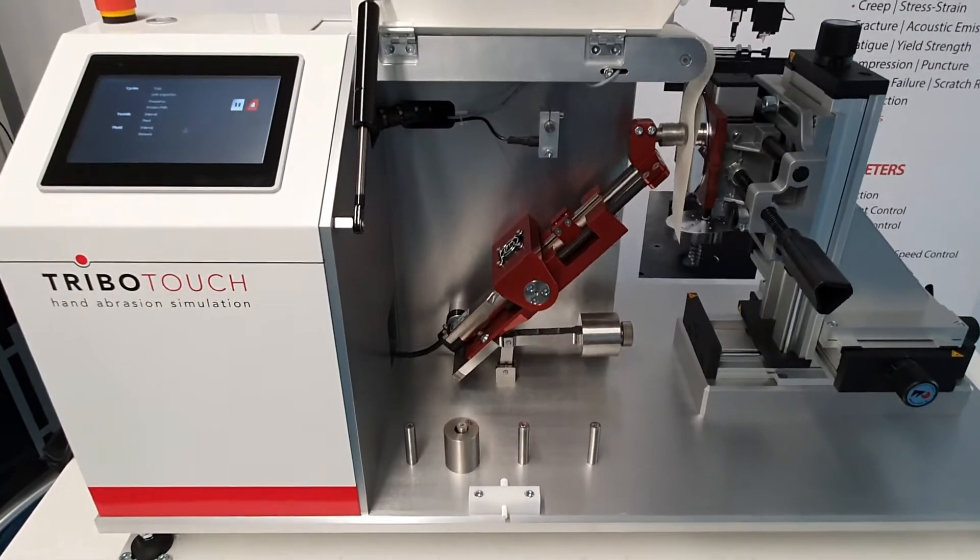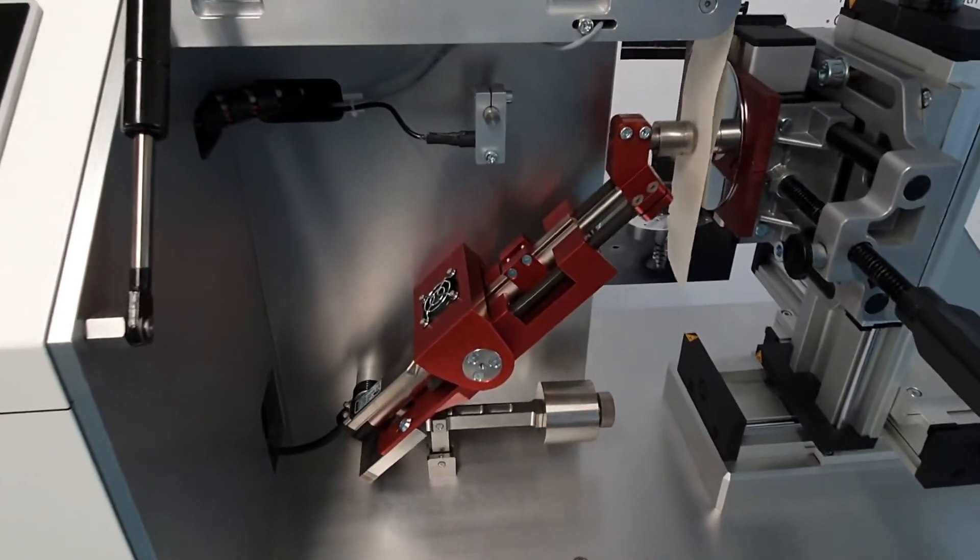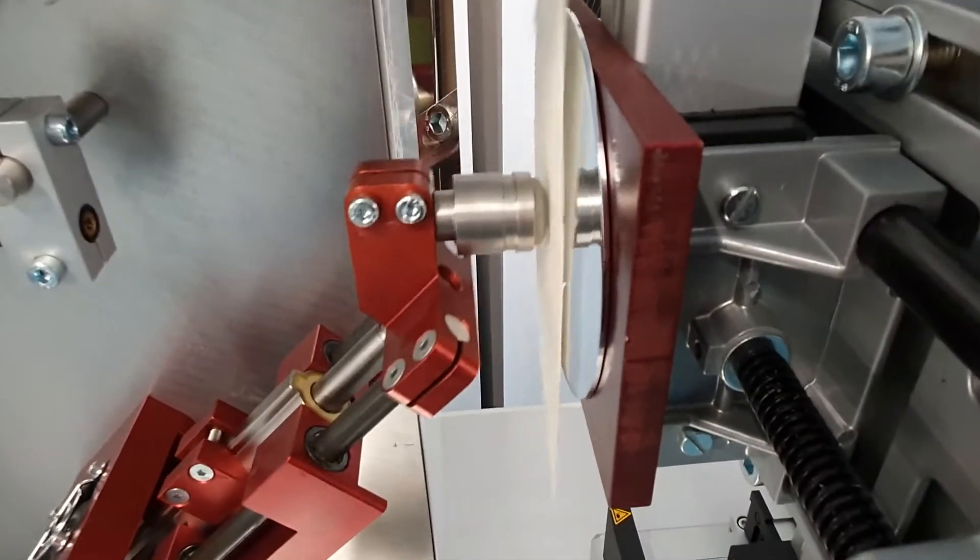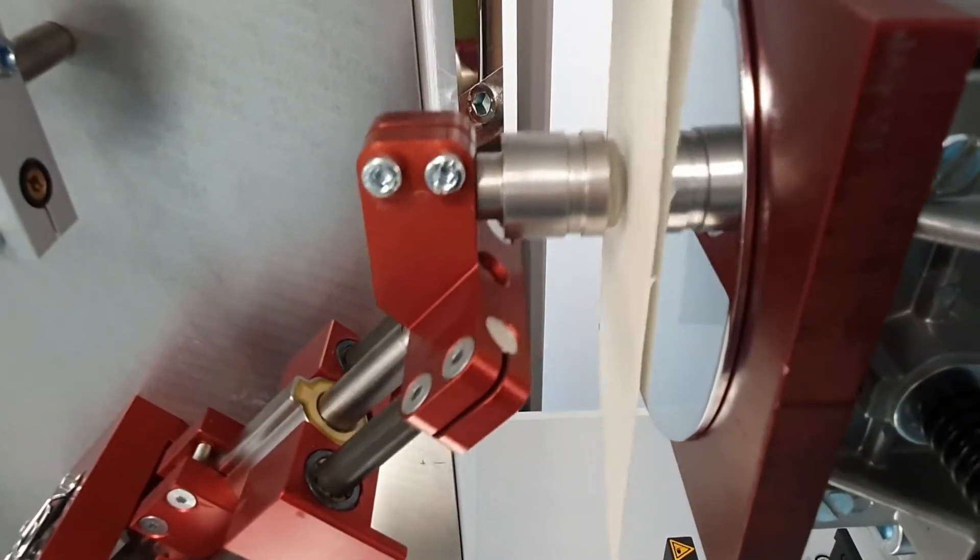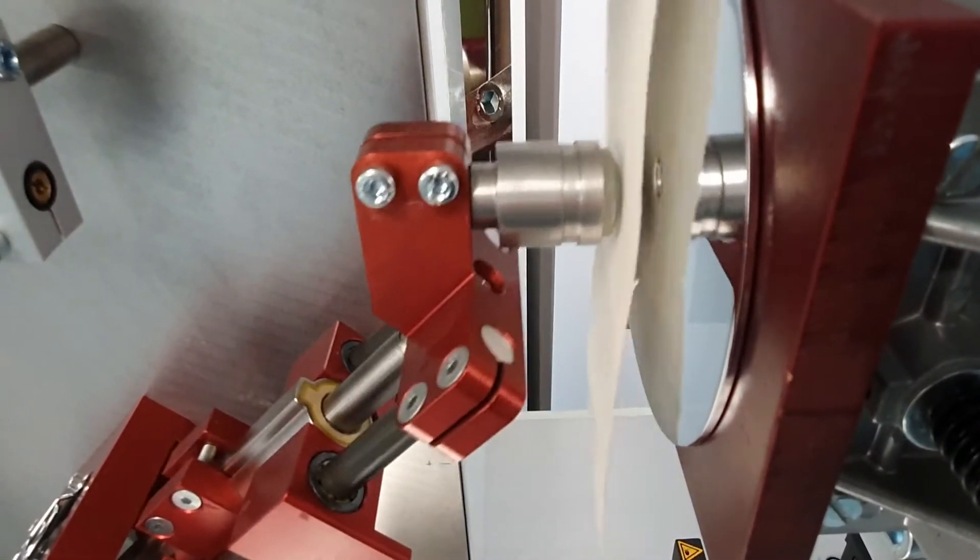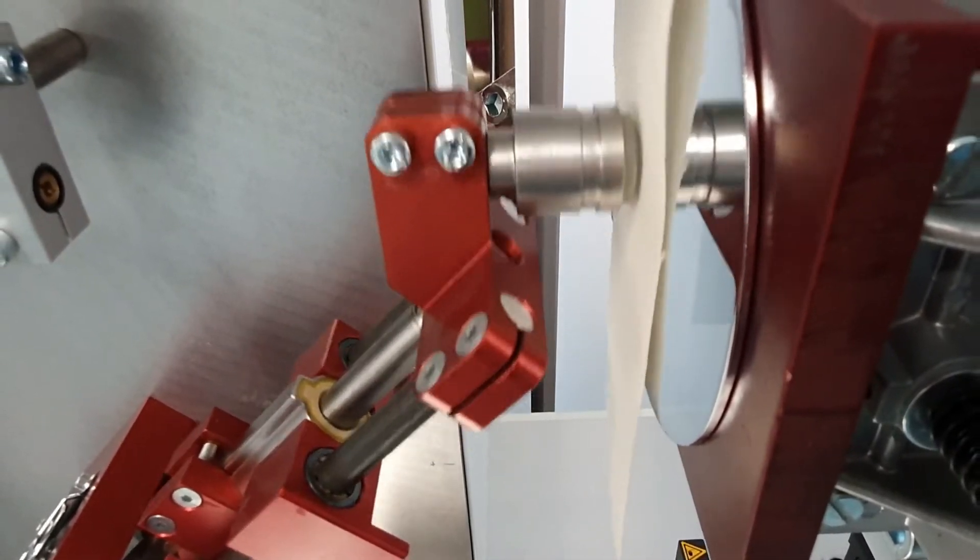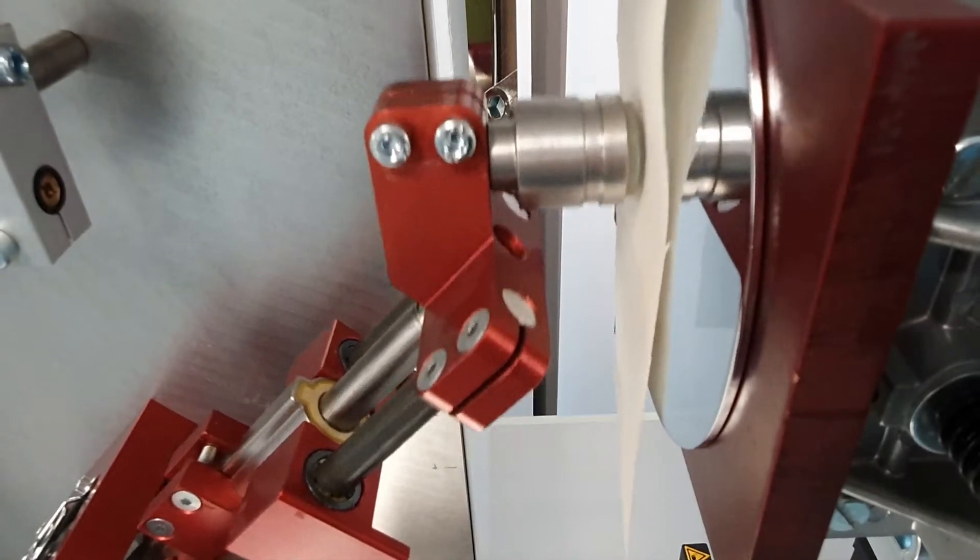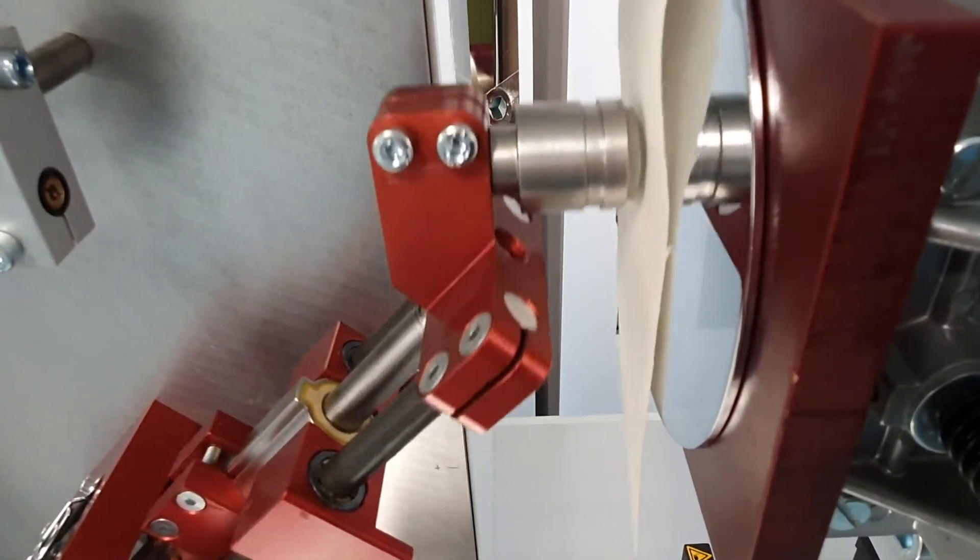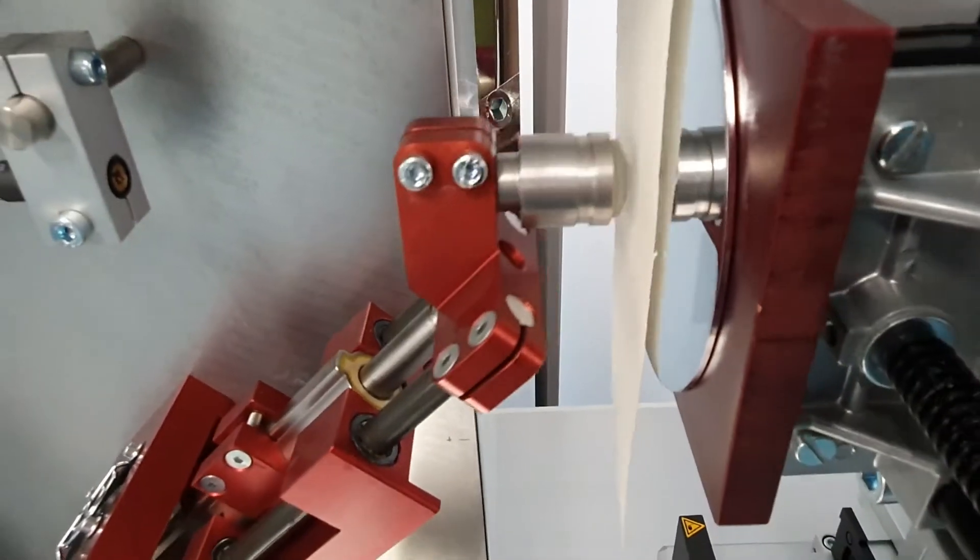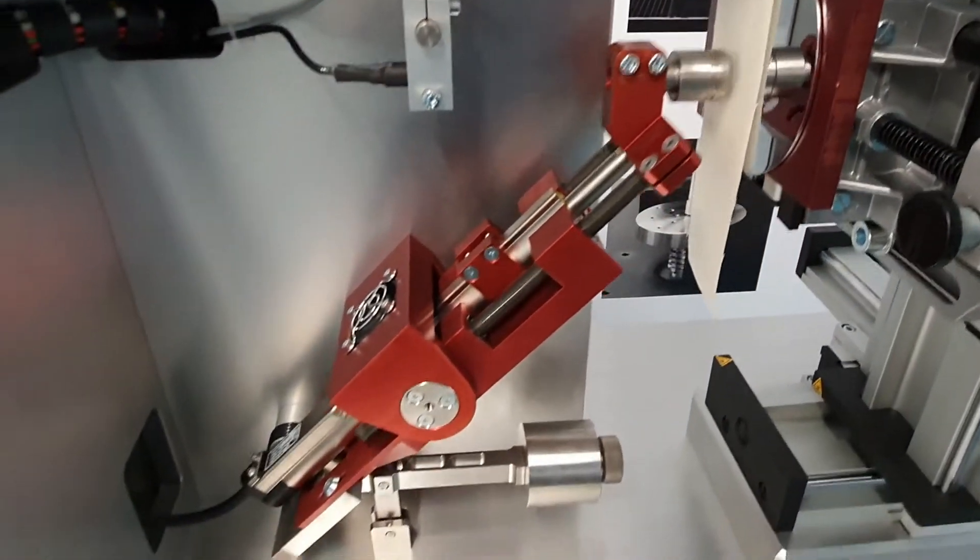The Tribotouch test instrument simulates the human physiology of touching a surface. A silicon test finger will approach the surface with a speed of 60 mm per second. After the impact, it will perform a friction path on the surface. Between the sample and the silicon test finger is a wool textile that simulates human skin.